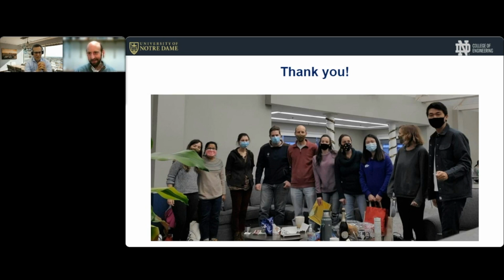Thank you. Okay, and we have one more question from Nicoletta Toja. It's a more practical one. How do you decide that you are in focus? Do we have to use a 1D mode and follow the aspect of interferograms? Or how do you do it?